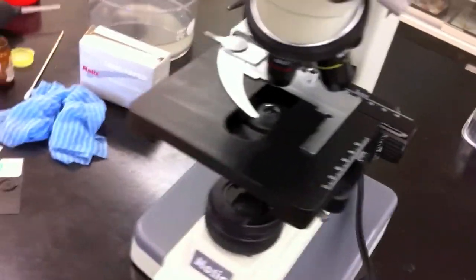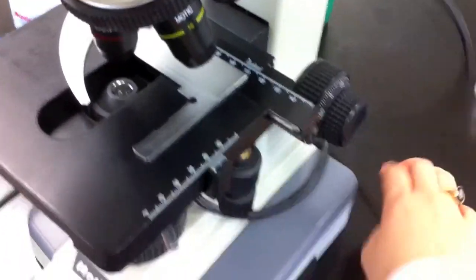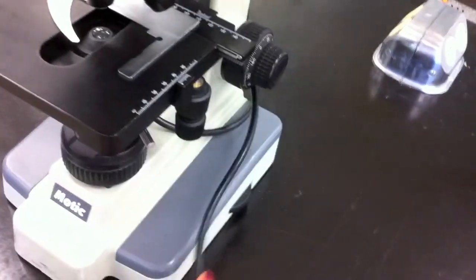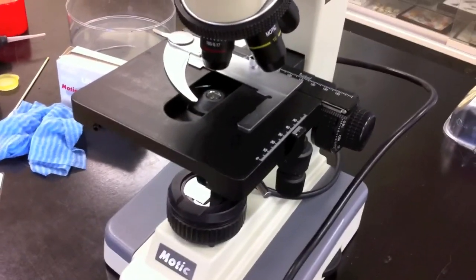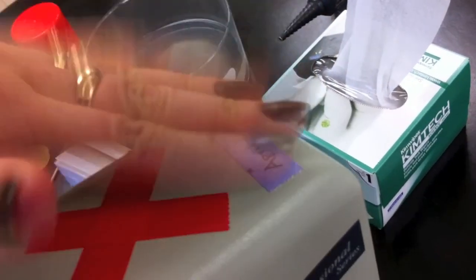Now we can wrap the cord around the microscope and put it away. Make sure that you cover it if you're not going to be using it right away so the dust does not collect on it. You should be good for another six months. We usually date every time we clean our microscope — we put the date at the back so we know next time when to clean it.